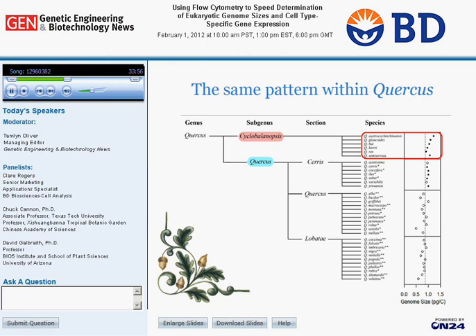And so this was very interesting. If you actually look at the Quercus, as I mentioned earlier, there are tropical Quercus and there are temperate Quercus. And so you can actually look at these genome sizes as well, and the same pattern is present at the genus level. The subgenus Cyclobalanopsis appears to have slightly larger genomes than the other subgenus, which is Quercus. And so you do have, again, the same pattern where the tropical species have slightly larger genome sizes.